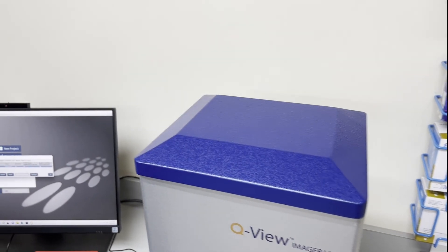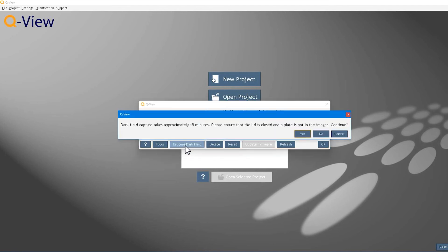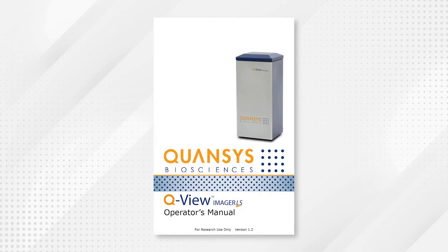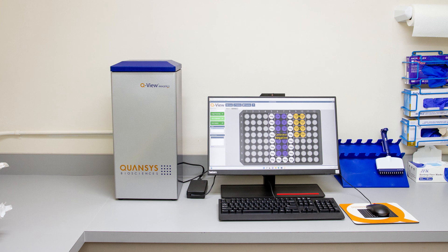Next, establish the dark field by going back to the Manage Imager menu and selecting Capture Dark Field. The process is automated and will take about 15 minutes. More information on the Focus and Dark Field processes can be found in the QView Imager LS manual. Congratulations! The QView Imager LS is now set up and ready to use.